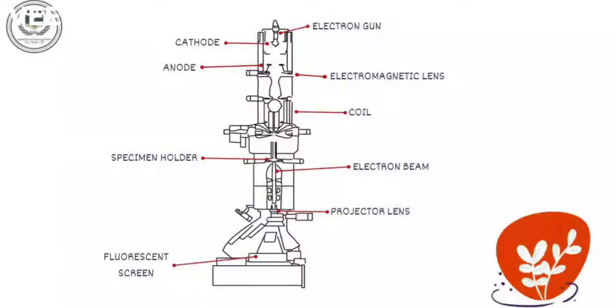A single projector lens may offer a magnification range of 5:1, and a greater range of magnifications can be produced by using interchangeable pole pieces in the projector. Modern microscopes use two projector lenses, one called the intermediate lens, to allow for a wider range of magnification and a higher overall magnification without increasing the physical length of the microscope column.